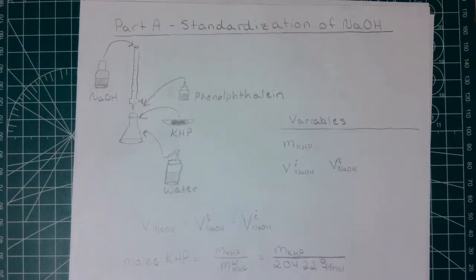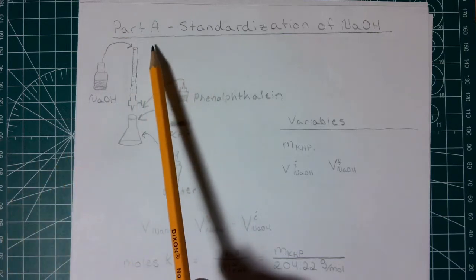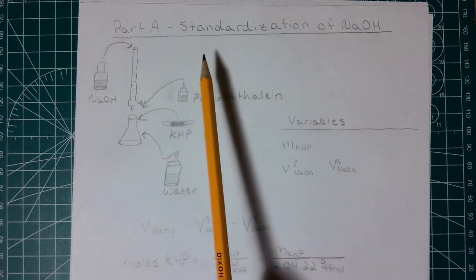Hello everybody. This week we're going to be doing volumetric analysis in our Labflow lab, and I wanted to take the opportunity to do a little video and explain a couple of things for you guys.